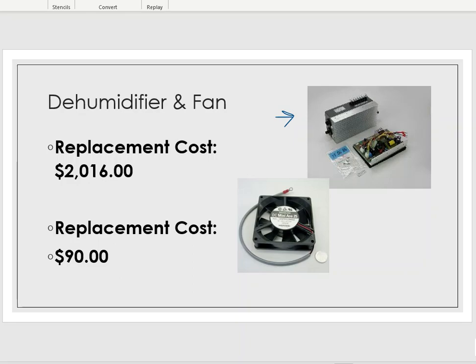If you are interested in replacing the dehumidifier, there's probably someone at your company that has done this before. If not, they probably have a preventative maintenance schedule with Shimadzu, and we call that a PM agreement. That preventative maintenance allows them to come in and double check to make sure the dehumidifier is working and that some of the other pieces and parts are working the proper way as well. So you're not caught off guard one day when you go over to the TOC instrument and something's not working out for you.